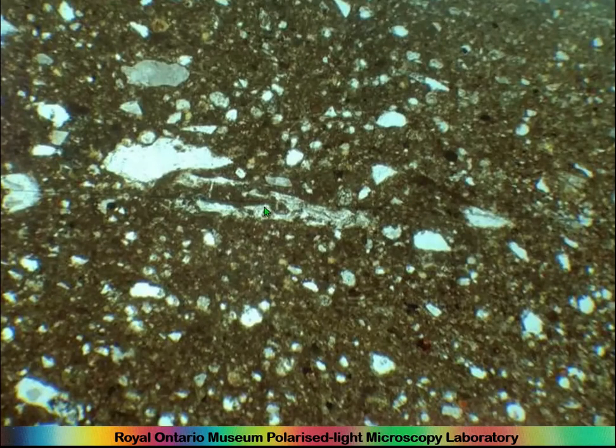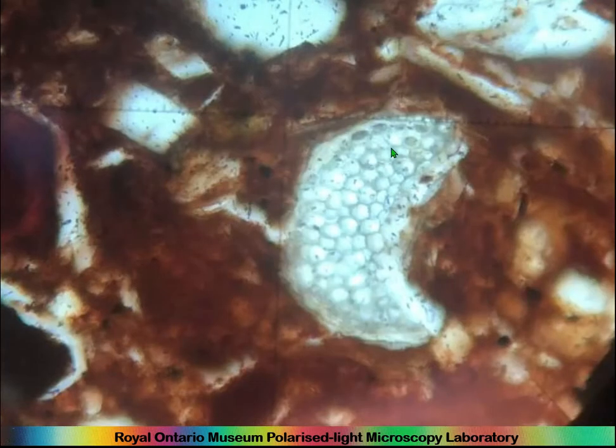And this is a bit of plant fiber here. This is interesting. This is a phytolith. So that's a siliceous framework within certain grassy plants, and this is very common indeed in the Nile, and it's probably papyrus.